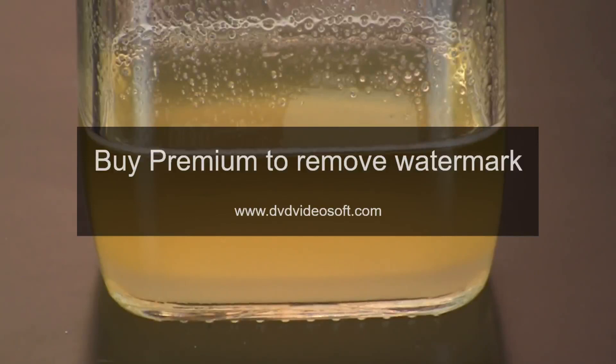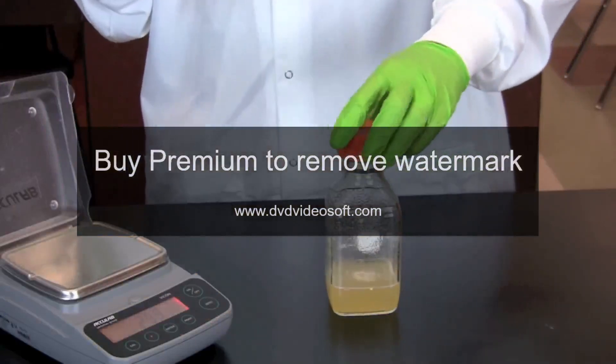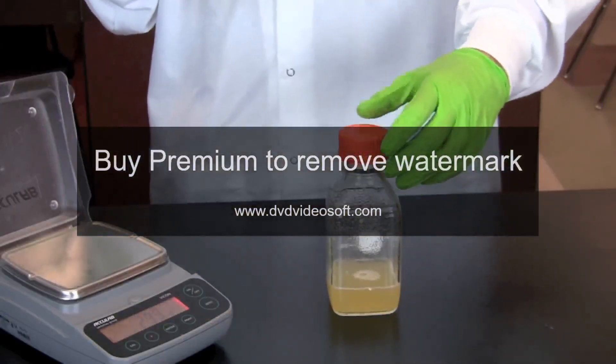When finished adding the agar powder, the solution will appear cloudy since the powder is not completely dissolved. Microwave the agar on a medium setting in 30-second increments for 1-2 minutes until it is clear. Make certain the cap is placed loosely on the bottle to allow steam to escape.